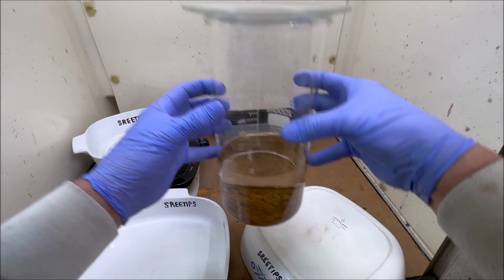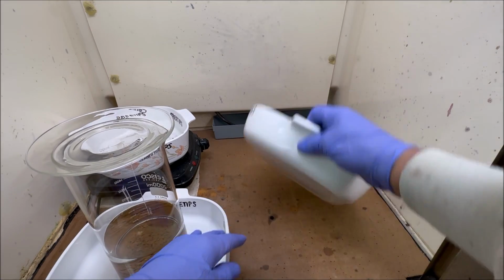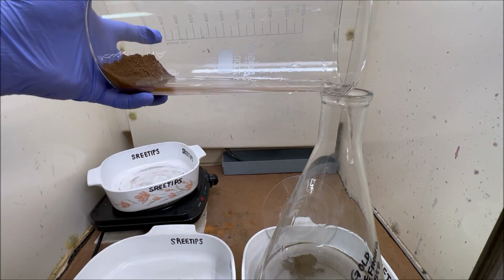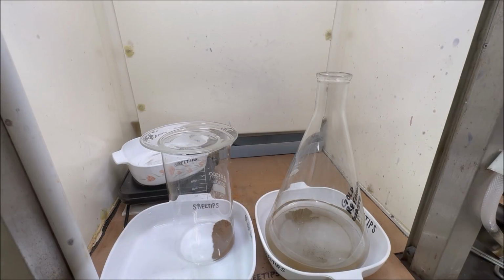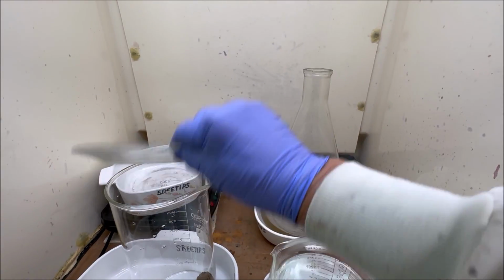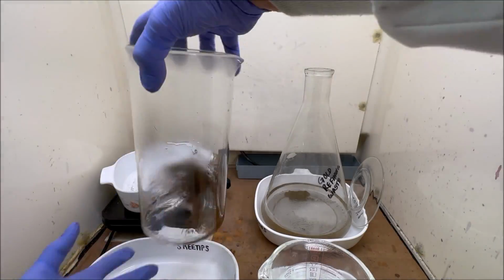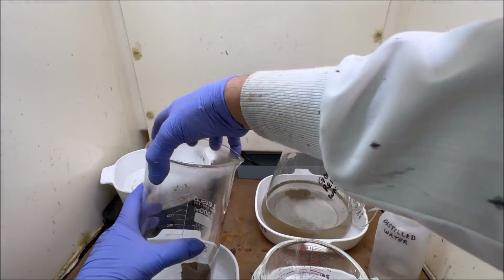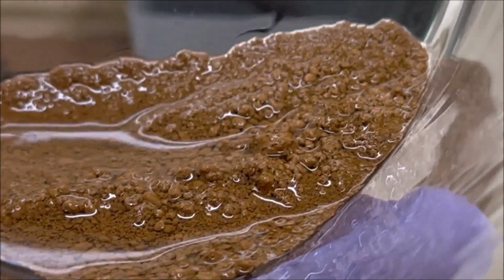Here's our beautiful gold powder. I've allowed it to settle completely. Now what we'll do is we'll pour off this waste solution into a waste container. Now what we'll do is rinse this off with some hot tap water. Here's the gold after our first refining.